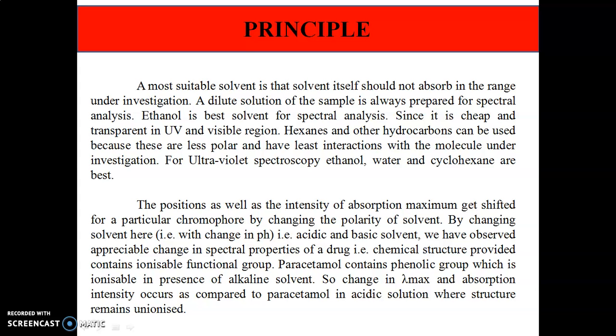And the last criterion for a good solvent is its ability to influence the wavelength of ultraviolet light that will be absorbed via stabilization of either the ground or the excited state.